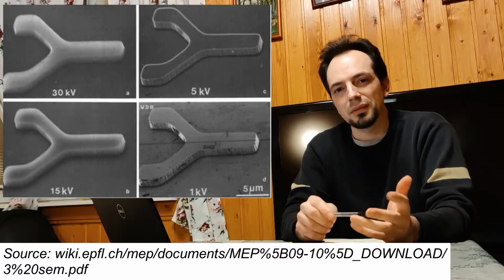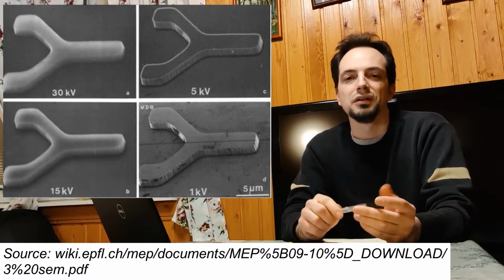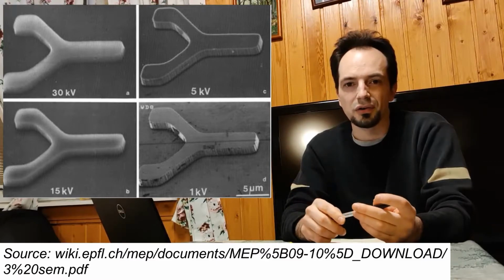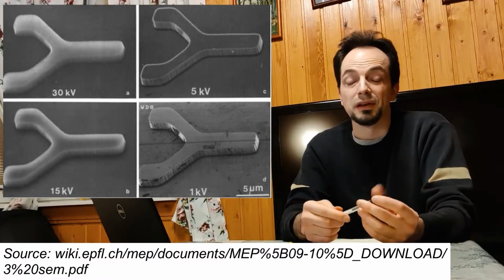If you are caring about very small details on the surface that may look transparent to the beam, you must lower your energy so that these details do not look transparent. But lowering the energy is quite difficult because a beam with lower energy is harder to steer, harder to focus, and harder to manipulate. So you have a choice.